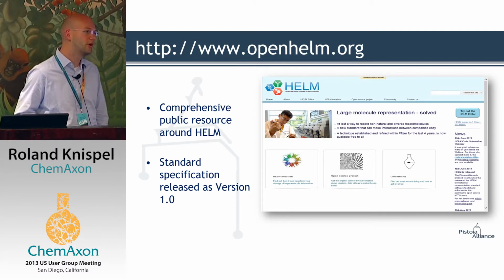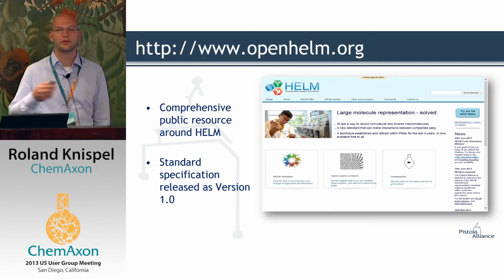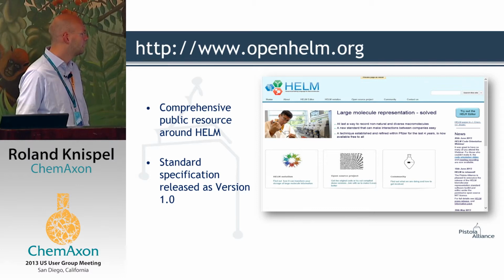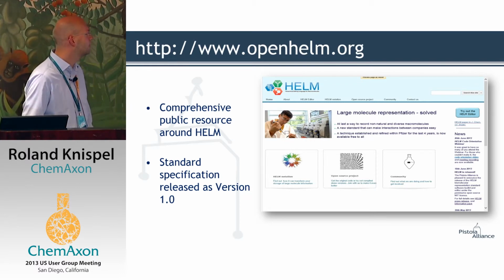What I'd like to point out is that if you haven't heard about HELM before, and I think it's been lingering around in the R&D community for quite a while already, there is a project homepage maintained by the Pistoia Alliance, openhelm.org.